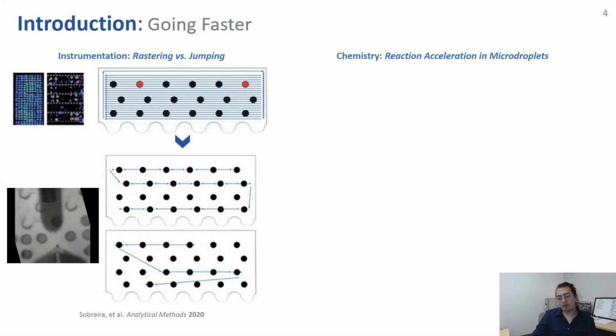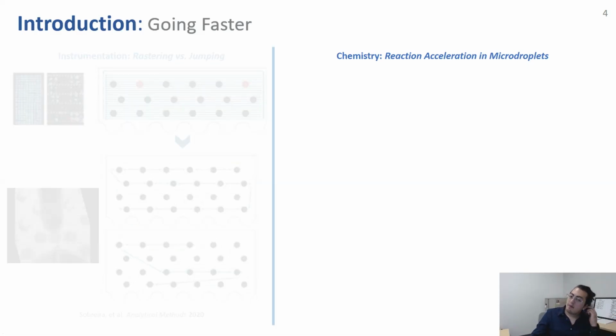There's another important factor, and this is mostly applicable to reaction screening. If you are screening organic reactions, you're typically going to have to mix your reagents and then incubate them or heat them or whatever it is, but you have to waste some time before you actually read the products of these reactions. If you think about a round bottom flask reaction, you're going to have to put it on a heating block for hours, overnight, whatever it is, to then see the reaction the next day and find the products. But that limits a little bit of your throughput, right? Despite you can do this in batch and so on, it limits your throughput.